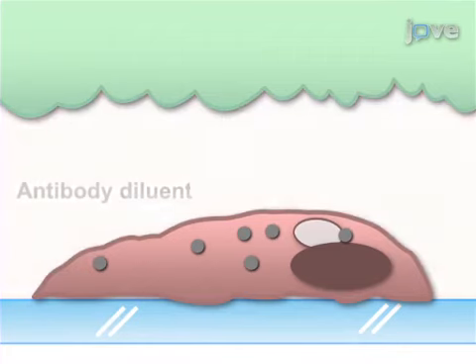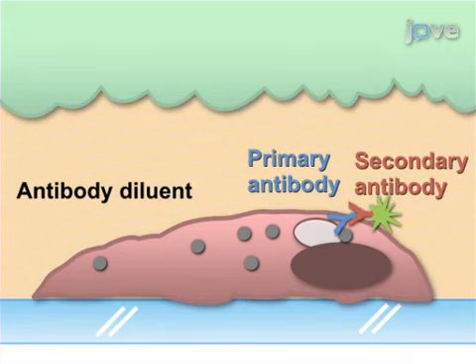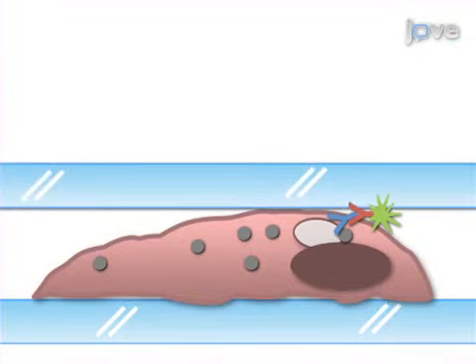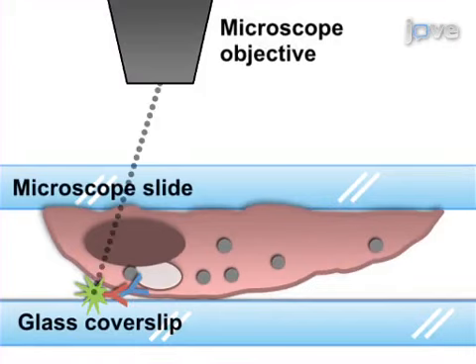localization. Next, fixed BE cells are incubated sequentially with primary and fluorescently tagged secondary antibodies in order to visualize changes in the selected target protein via fluorescence microscopy. Results are obtained that show how drug treatment of BE cells alters protein localization and cell structure based on visualization of immunofluorescent staining. Though this method can provide insight into Barrett's esophagus, it can also be applied to other systems, including cancer and normal cells.